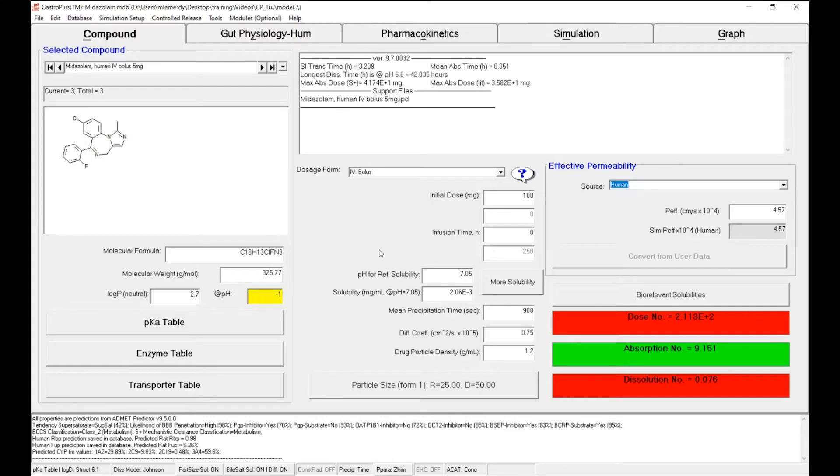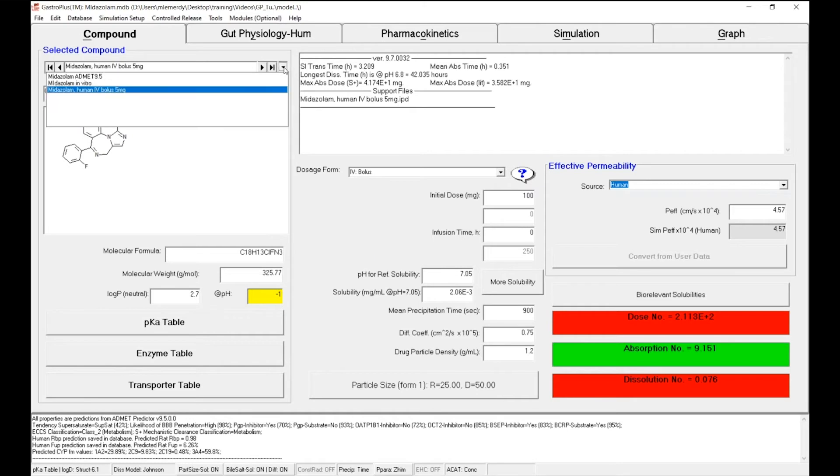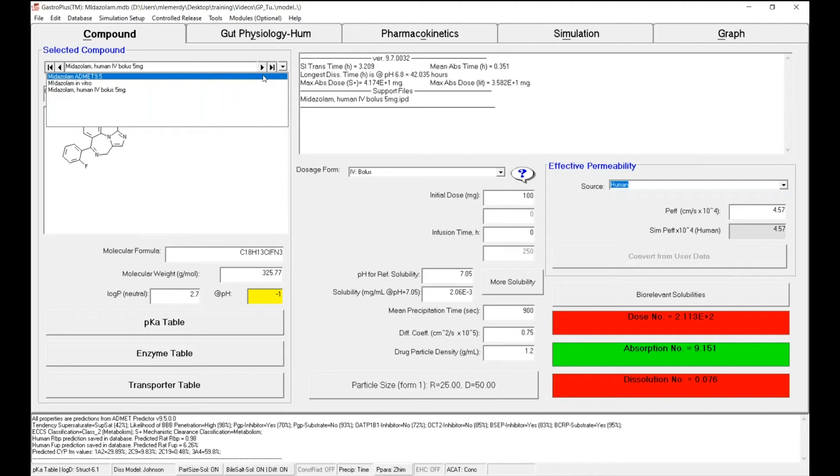On your screen, you can see the midazolam database as we left it at the end of phase 1. As a quick reminder, the aim of phase 1 was to describe the midazolam plasma concentration time course following a single IV administration of 5 milligrams using a compartmental model. To do so, in this database, we've created three records. The first record we used to import the structure and predict all of the physicochemical properties of the drug using the ADMET Predictor module.